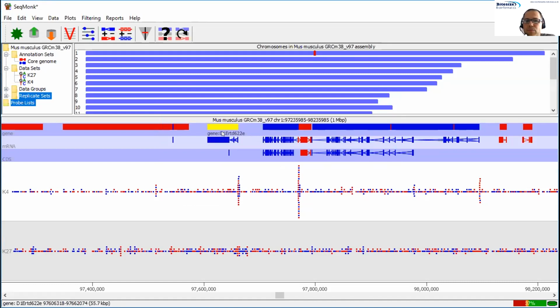Colors in here are important. So the features and indeed the reads all come as either blue or red. Everything that's red is on the original top strand of the genome, so its orientation would be running kind of left to right in this view. Anything that's blue would be on the original bottom strand, so that would be running right to left. Okay, so the colors indicate the directionality, and that's true for both the features, and we'll be able to see in a bit more detail once we zoom in a bit, the reads down here.